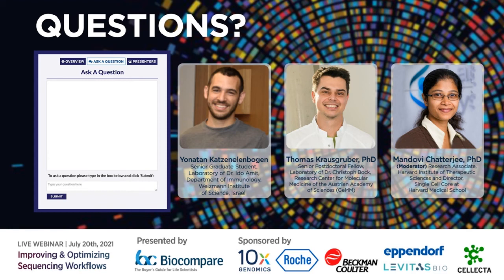So Jonathan, you sort them yourselves, right? So how stringent are your sorting conditions? How many markers do you use to select for these rare populations?